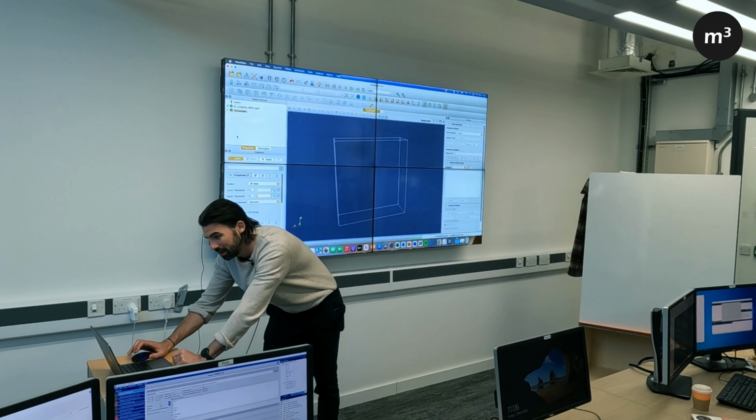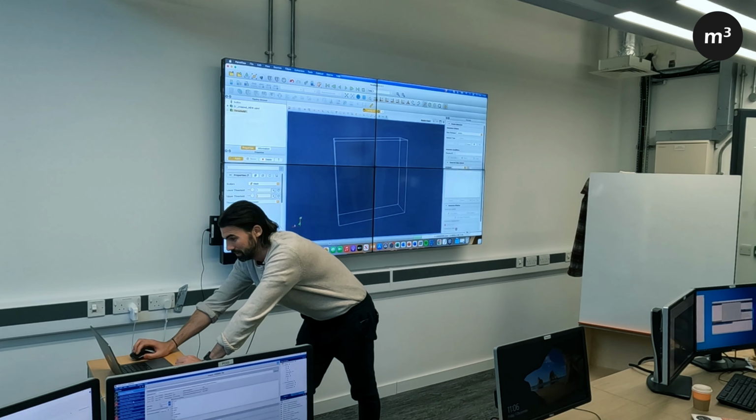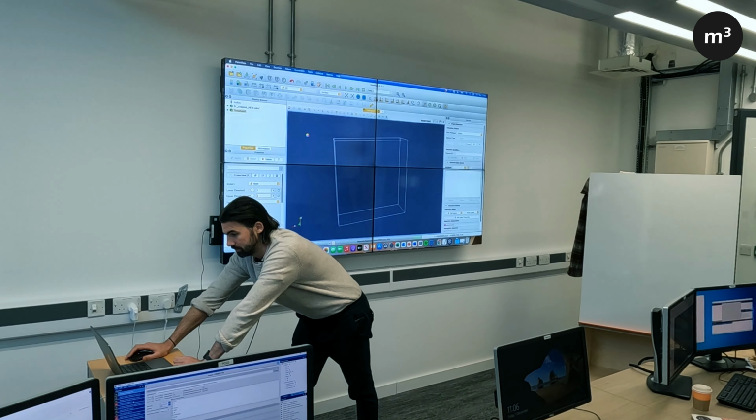So if we click apply again, this will take a while on my laptop, but will be quicker for you, hopefully, on these machines. Uh-oh. It's coming.